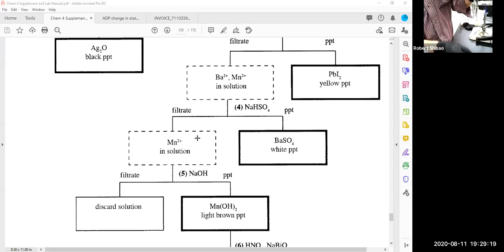Okay, I'm getting a precipitate here, but it doesn't look so light brown. Kind of looks white. But color can be very deceptive. This dropper is leaking, so I'm going to just pour from the bottle.